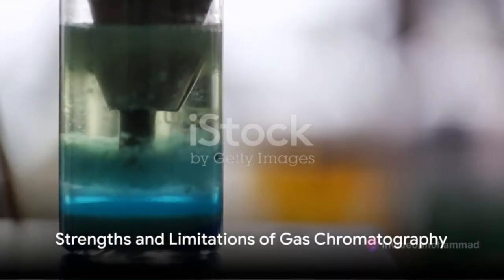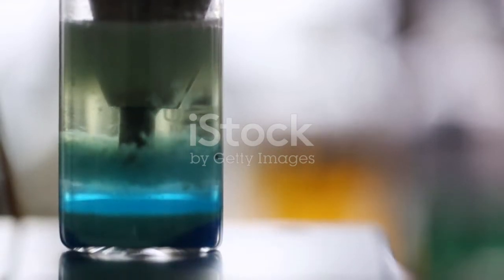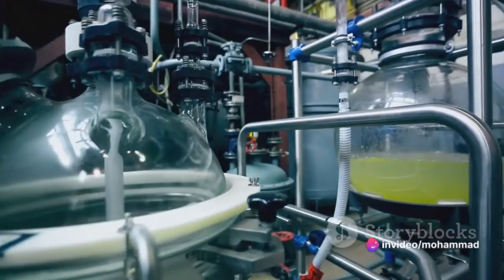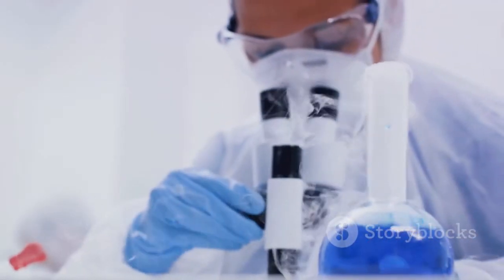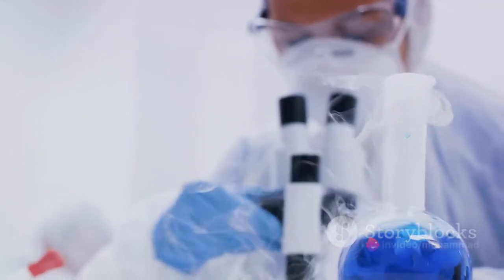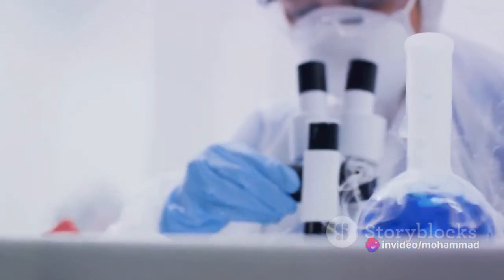Like any method, gas chromatography has its strengths and limitations. Knowing these can help us maximize its advantages and mitigate its weaknesses. Let's start with the strengths. Gas chromatography, or GC for short, is highly regarded for its high resolution. This means it can separate compounds that are very similar in structure, making it incredibly precise. It's like being able to tell apart identical twins just by looking at their fingerprints.